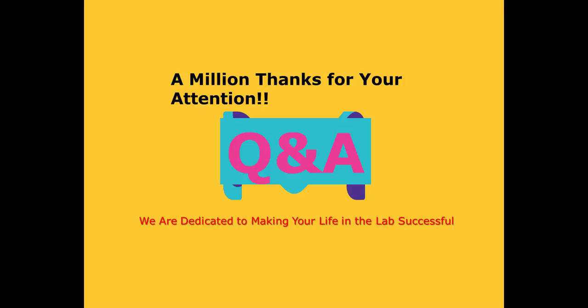It's also advantageous to have a hot plate to warm the sample on. So those three things are enough to get most people started, and a ring stand too. There are accessories available that make life a little easier. And then eventually, if you find that you like the technique and it's working for what you want to do, many labs will then convert to an automated system like what you saw on my slides. I have an XYZ autosampler that has a head on it for SPME, and all that equipment is readily available. So technically, you don't have to make any changes to your GC just to try it. You don't need a special inlet or anything. You just need to have a holder and fibers.